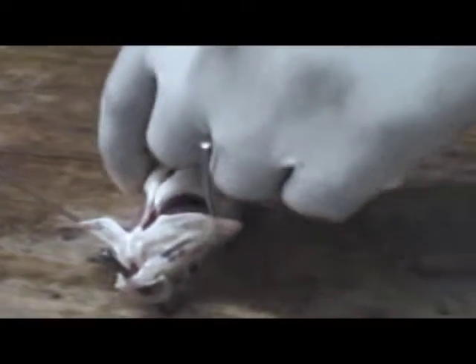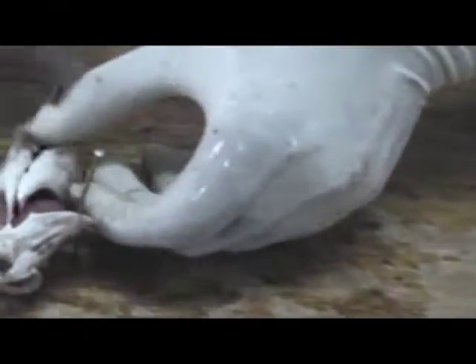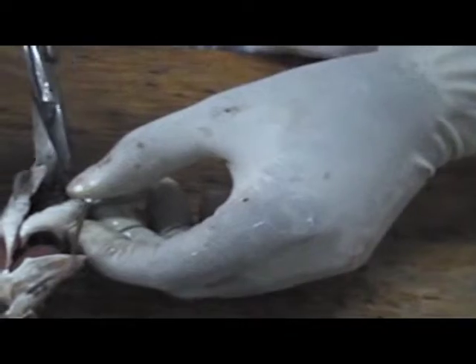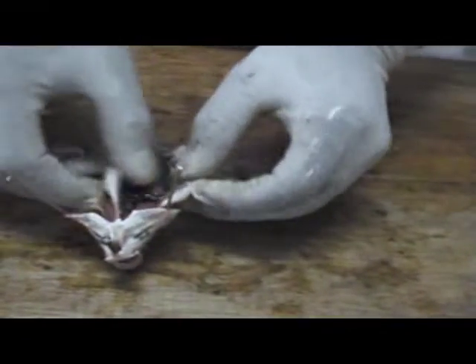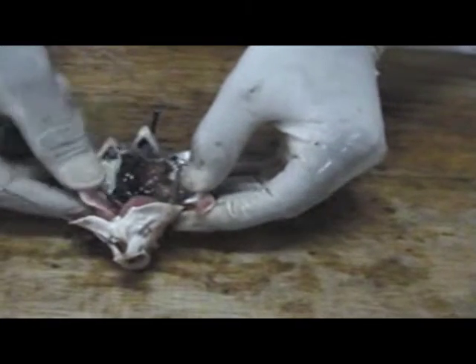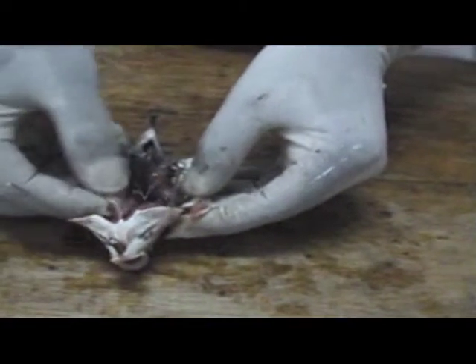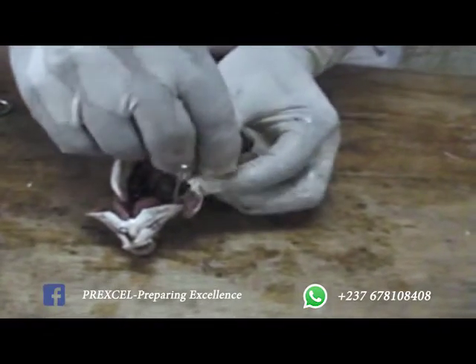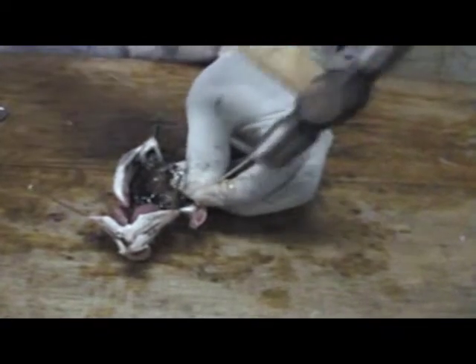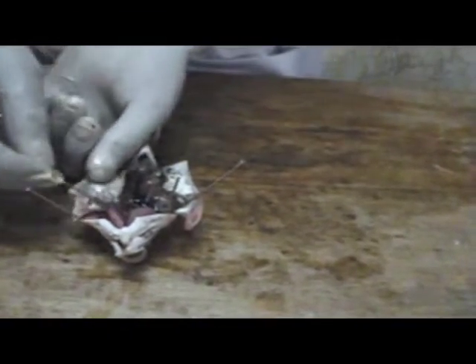What we can do now is increase our incision to go down, being careful not to cut the intestines. We now open it up like that on two sides, and we pin it onto the board.